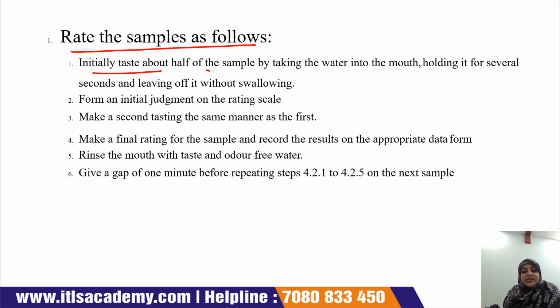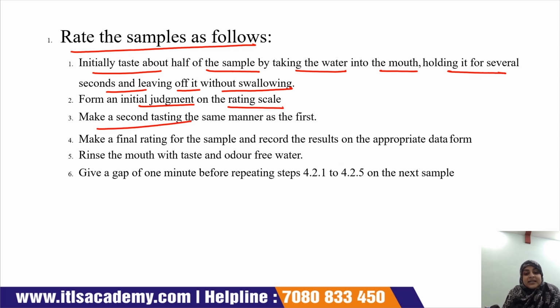Initially, taste about half of the sample by taking the water into the mouth and holding it for several seconds and then discarding it without swallowing. So the first thing is we have to keep it in the mouth for several seconds. Form an initial judgment on the rating scale. Make a second tasting in the same manner as the first and make a final rating for the sample, and record the result in the appropriate data sheet. Then we rinse the mouth with taste and odor free water. Now give a gap of 1 minute before repeating the step.